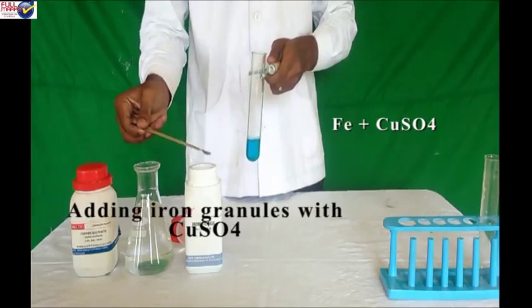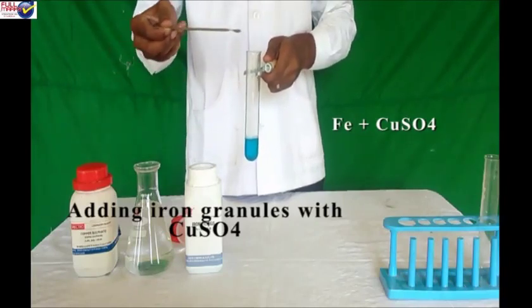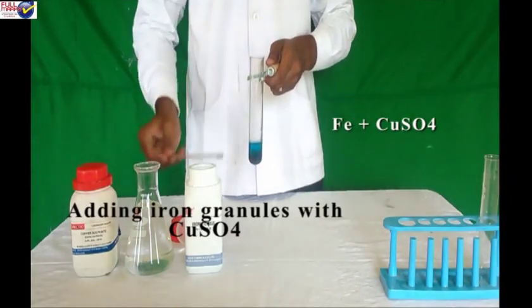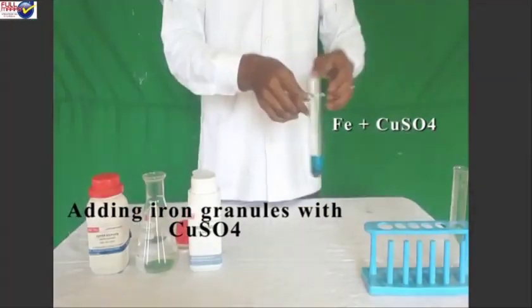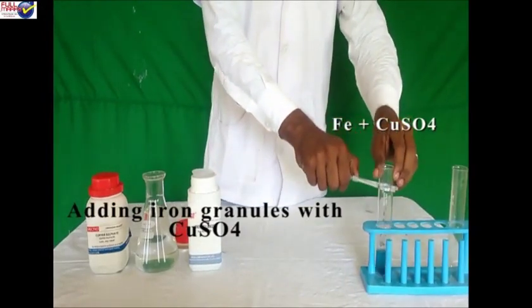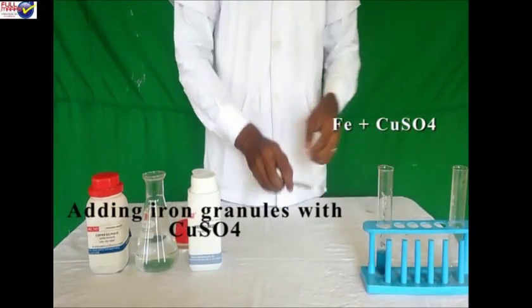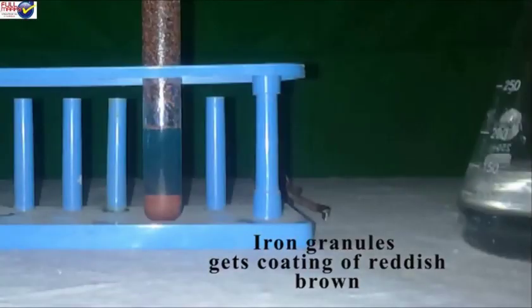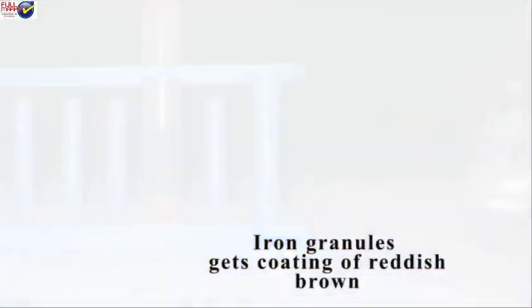Procedure. 1. Take copper sulfate solution in a test tube and add a pinch of iron filings to it. After 5 to 10 minutes, the blue color of CuSO4 solution changes to green color. Iron filings get a coating of reddish-brown copper metal.